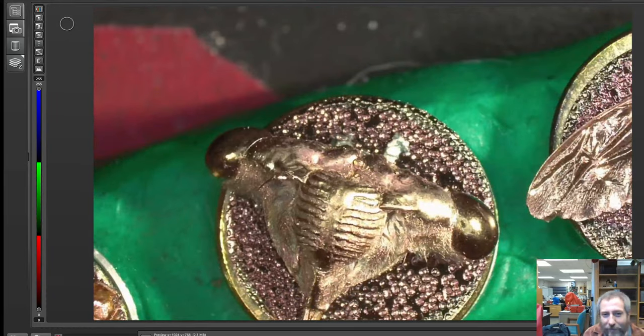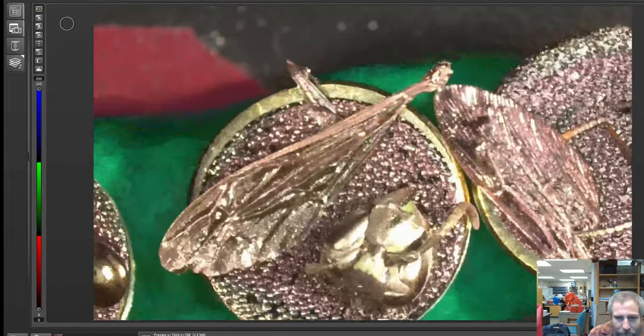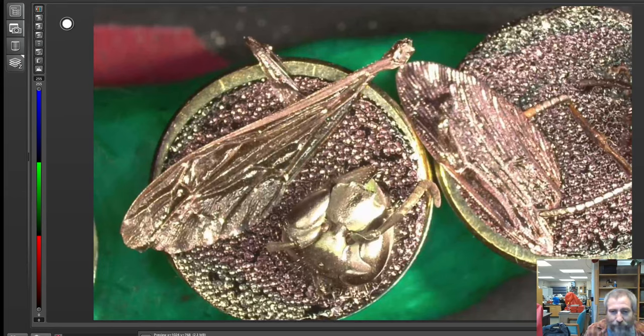So we're zoomed in here on it in the middle. And then, just for clarity, I think we also looked at a white-faced hornet when we were looking through things when Pacific was here. So these are some of those samples.